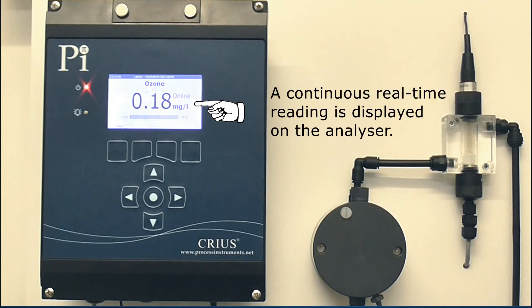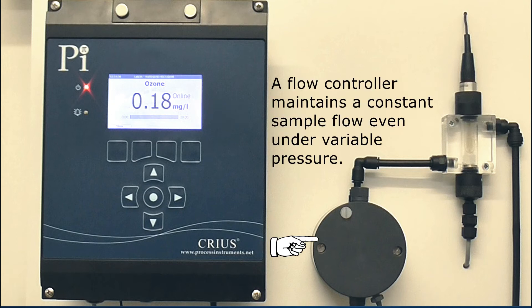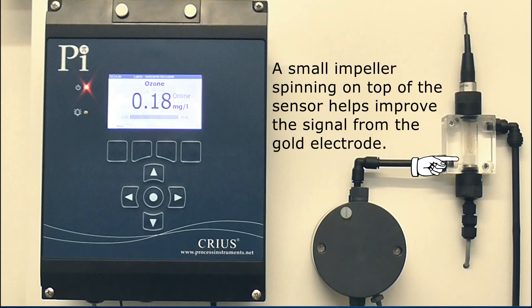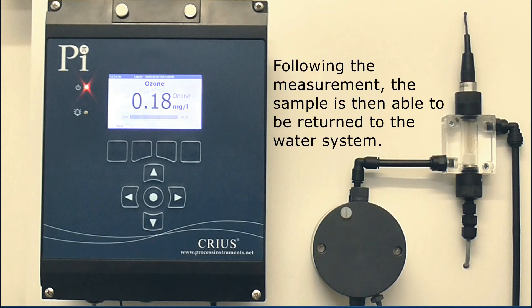A continuous real-time reading is displayed on the analyzer. A flow controller maintains a constant sample flow even under variable pressure. A small impeller spinning on top of the sensor helps improve the signal from the gold electrode. Following the measurement, the sample is then able to be returned to the water system.